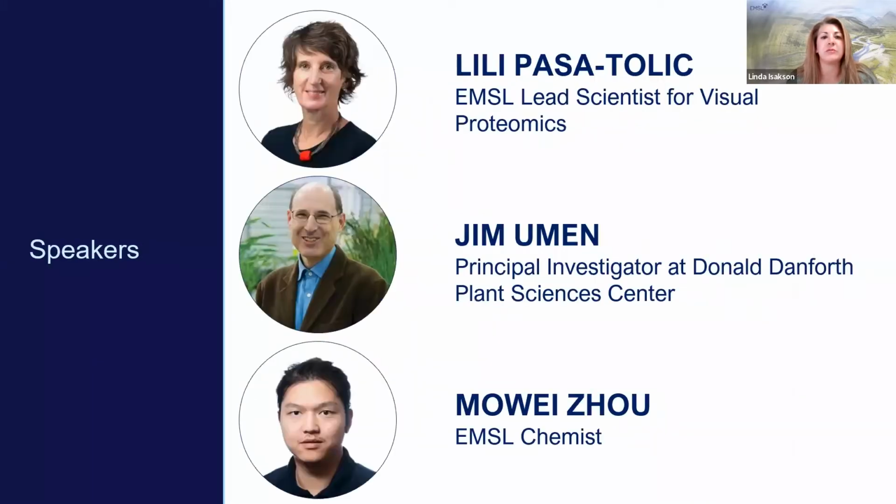So today we're going to begin with EMSL lead scientist for visual proteomics, Paša-Tolić, who will give an overview of top-down and native proteomics and the capabilities EMSL offers in this area. After Lily's presentation, James Umen, principal investigator at the Donald Danforth Plant Sciences Center, will discuss how he uses EMSL capabilities to identify core histone proteins and their proteoforms in green microalgae. We will end with EMSL chemist Mowei Zhou, who will showcase how mass spectrometry can resolve heterogeneity and ligand metal ion binding of protein complexes.